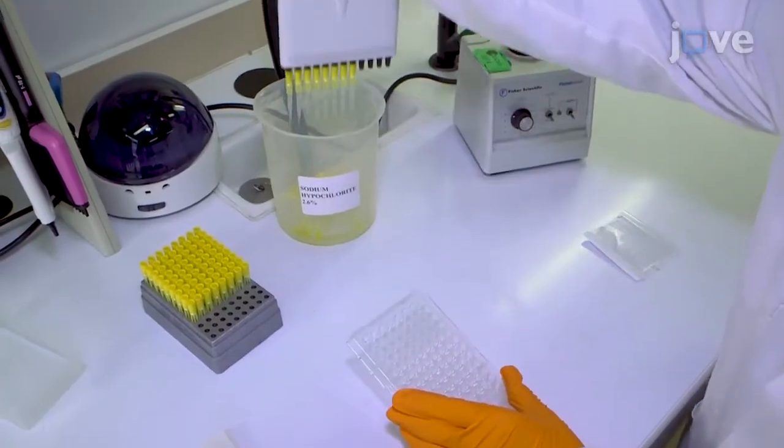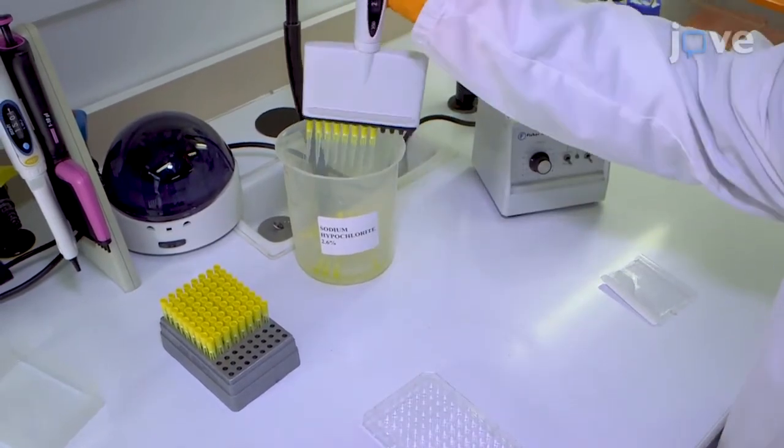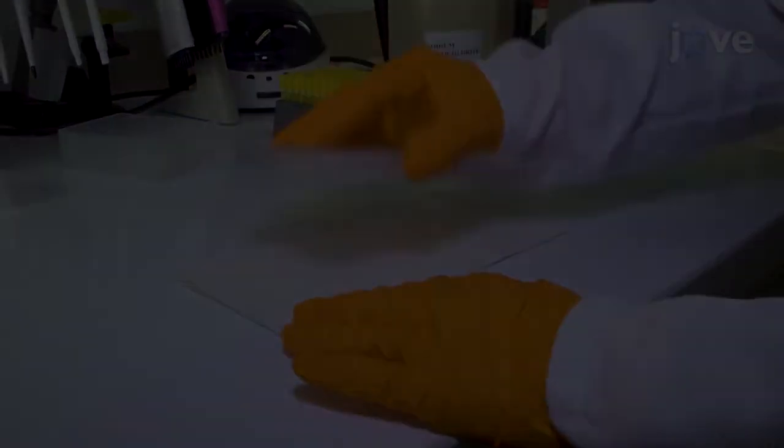Then, carefully aspirate and transfer the well content into a recipient containing a solution of 2.6% sodium hypochlorite. Invert the microplate.